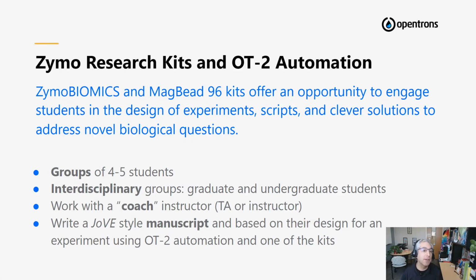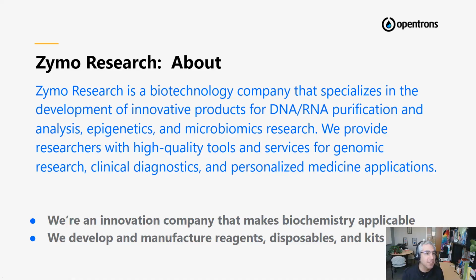People got really creative and produced detailed scripts as well as articles with the steps and the reagents. And this was all thanks to the availability of the OpenTrons protocol designer and these kits from Zymo. Now I'm going to transition over to how Zymo allowed us to do this.